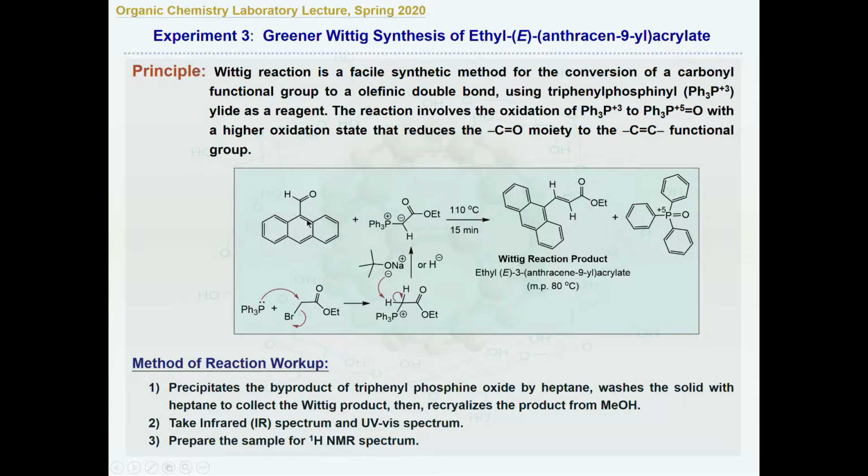Once it becomes a liquid, you'll be able to stir the mixture, and with molecular contact with the ylide reagent, the reaction will begin. Now, the TA gives you the reagent right away without prior preparation. In the case of graduate students, they have to prepare it themselves, so I will give you the chemistry of how to prepare that. Actually it is very simple, not very complicated. It's an in situ reaction.